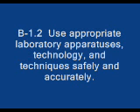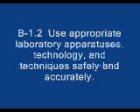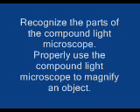Today's lesson correlates to standard B1.2: use appropriate laboratory apparatuses, technology, and techniques safely and accurately. The objectives are to recognize the parts of the compound light microscope and to properly use the compound light microscope to magnify an object.